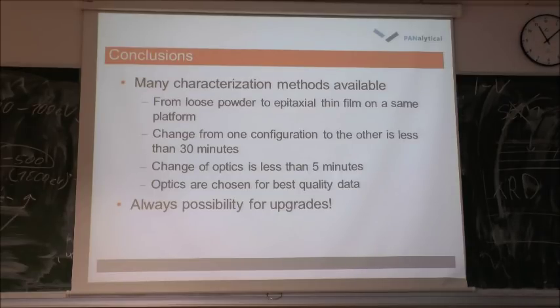Okay. Maybe here I would like to mention one more thing, that in addition to this diffractometer, we have one relatively new or old diffractometer. I don't know, if something is 10 years old, I don't know whether it's old or new. That diffractometer is actually used for routine powder analysis. So basically, we collect data from powders on the diffractometer D4, which is from Bruker, while we do more profound powder analysis and thin film analysis on this analytical device.